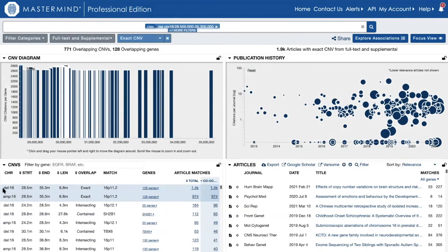I can see here the literature that relates to the deletion at the top. I can see that there's 1.4 thousand associated articles at this time, and for the amplification, I can see that there are 974 associated articles.